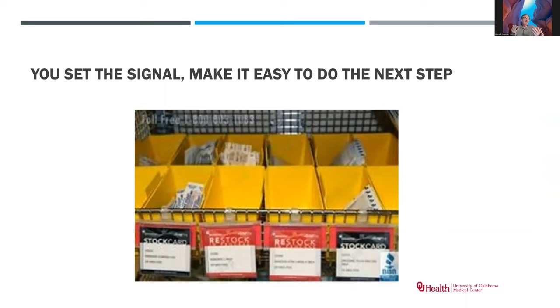And you also want to make inventory easy, not just for one person to manage, but for anybody who's engaged in the process. So this is one little lean tool. You know, when the box gets empty, I pull out this restock card and I put it on the manager's desk, and it says, "Order more of this." And that goes into the orders that are going to go in that week, and so on and so forth.